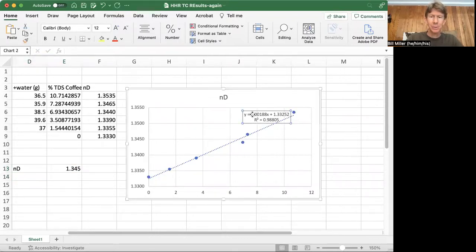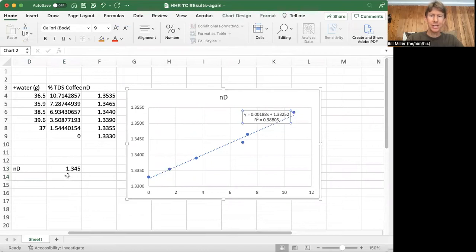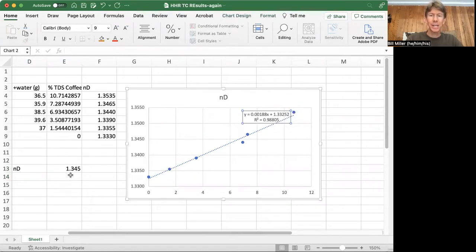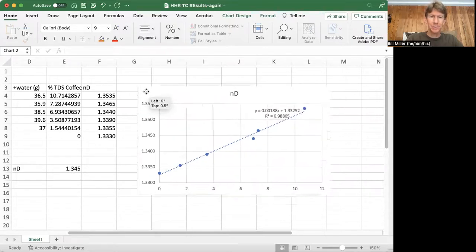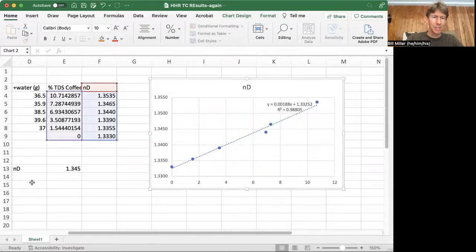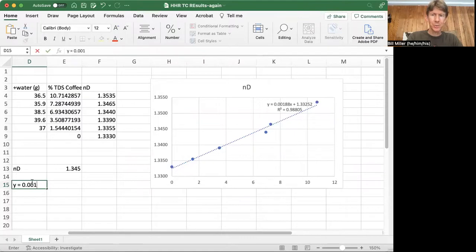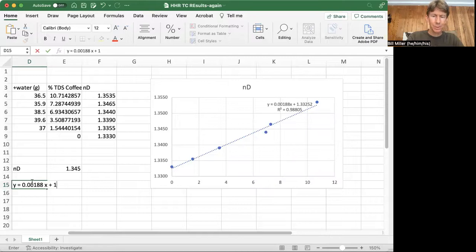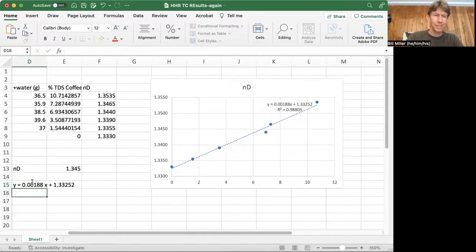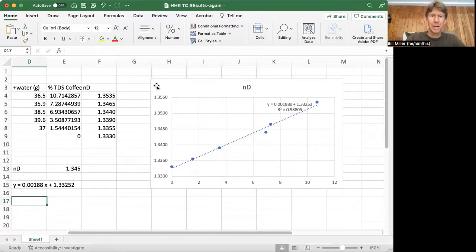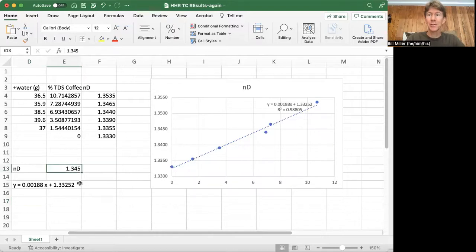And I have an equation right here that says y equals 0.00188x plus 1.33252. So my equation goes like this: y equals 0.00188x plus 1.33252. So that's my equation. And my y-axis, my y value is my refractive index, 1.3450.